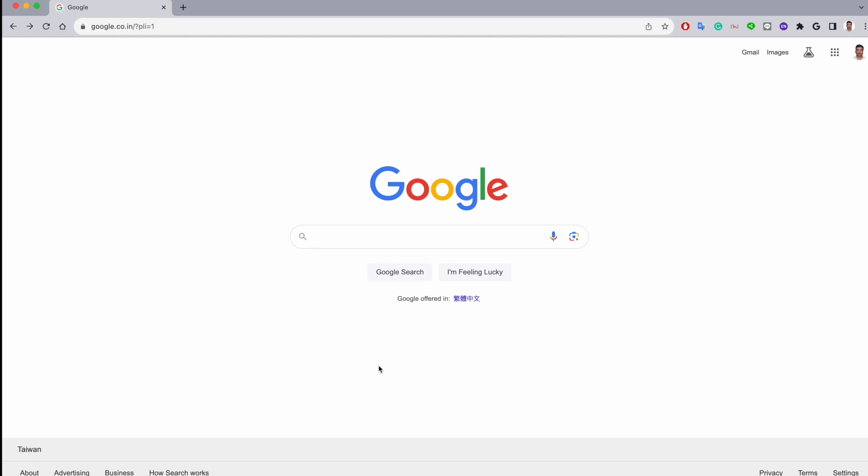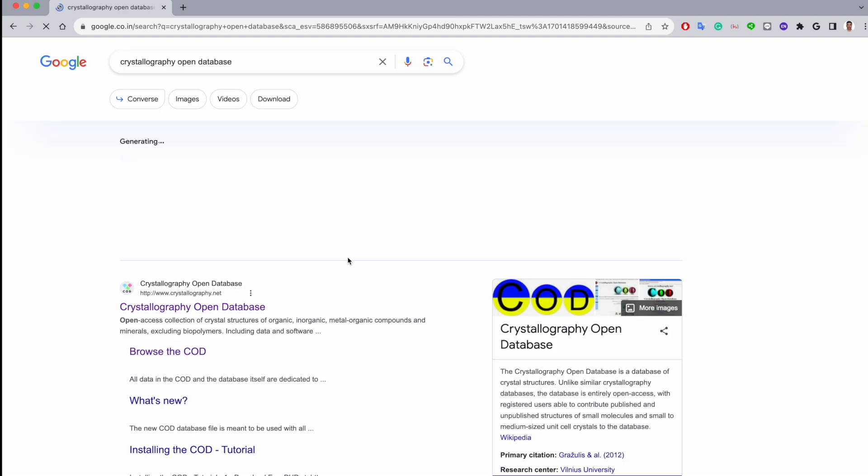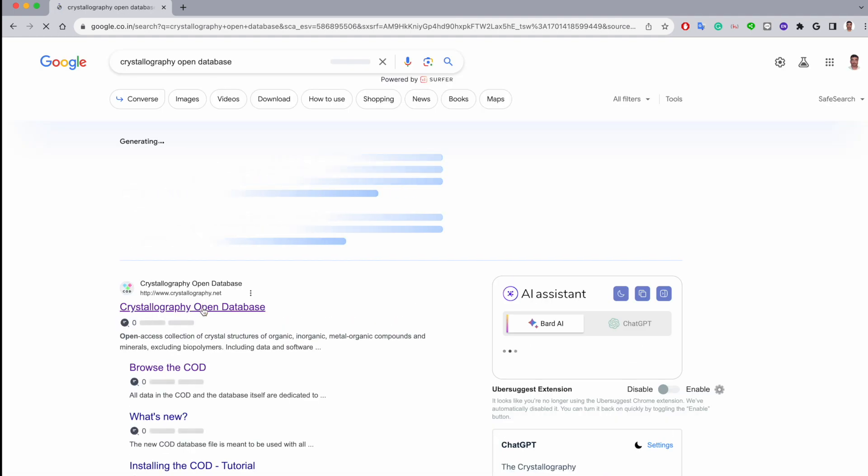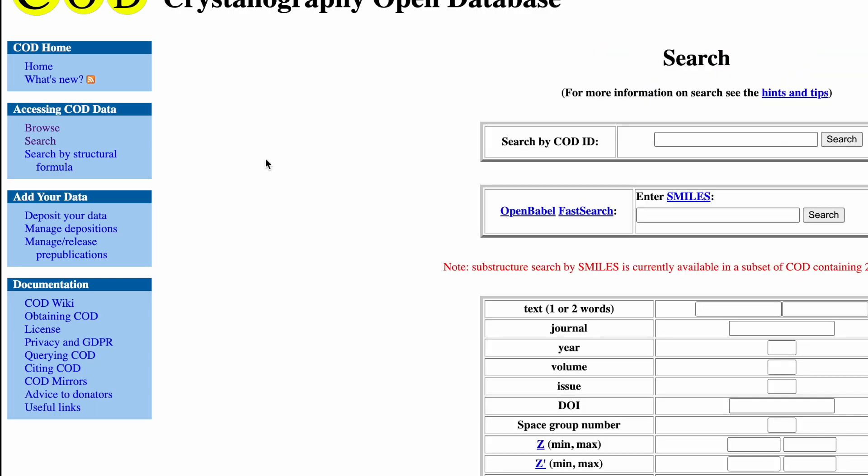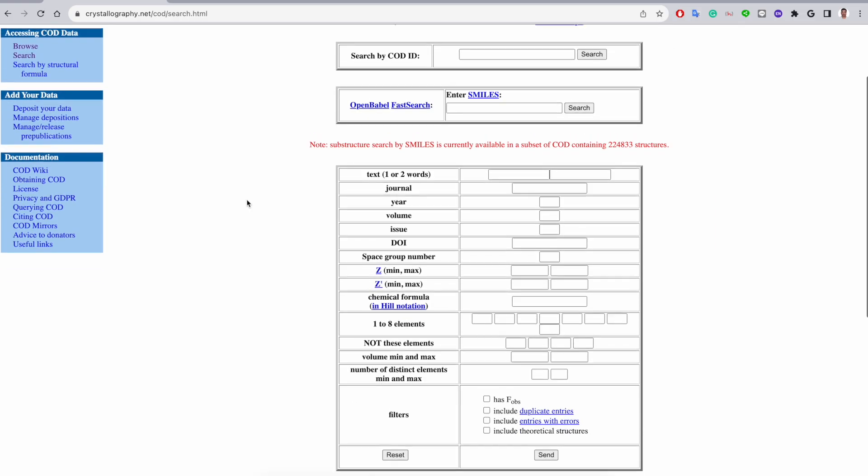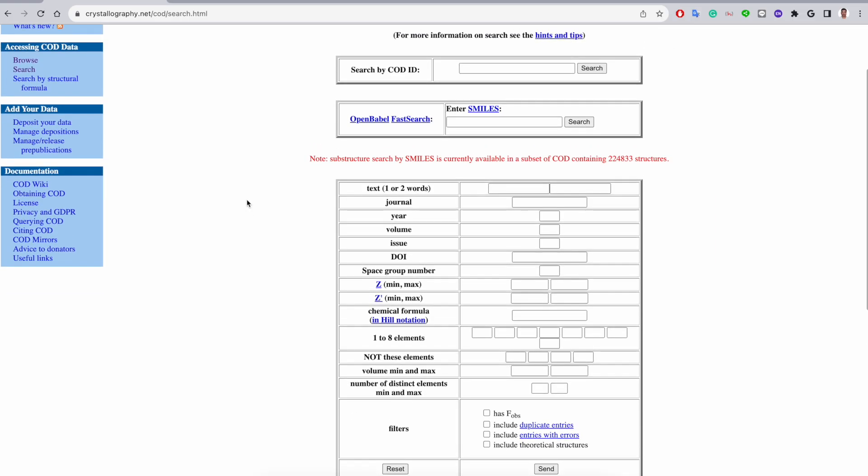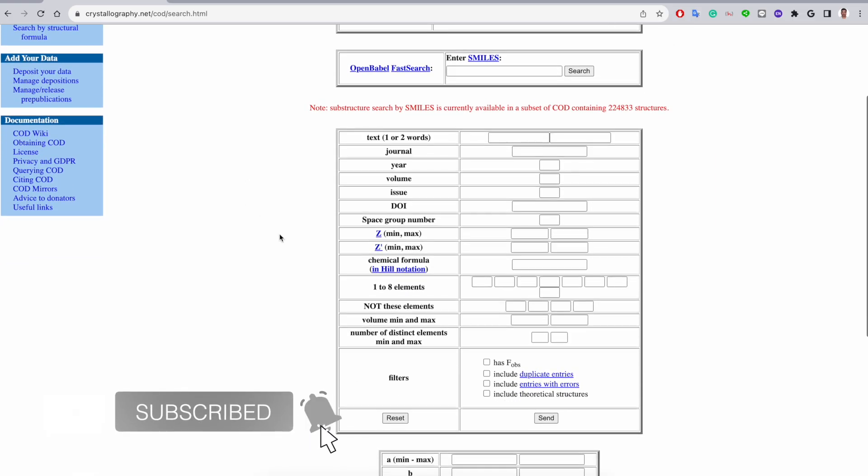In this video I will show you how to download CIF files. Go to the browser and type 'Crystallography Open Database', then click on this website. On the left-hand side you will find options for the search. Click over here and this page gives you different ways through which we can search for CIF files. I will show you one of the ways.